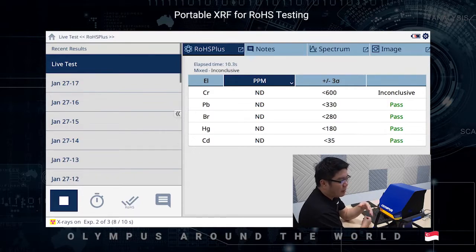When X-ray is emitting, you will see a blinking light all around the workstation. In less than a minute, you will be able to get the results with the pass-fail analysis.